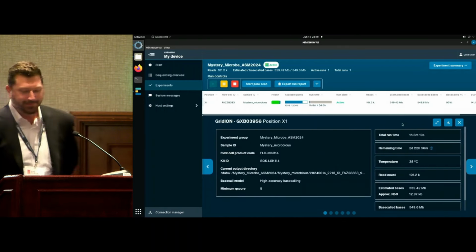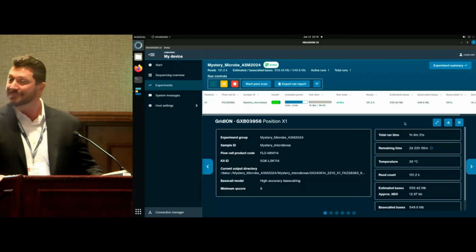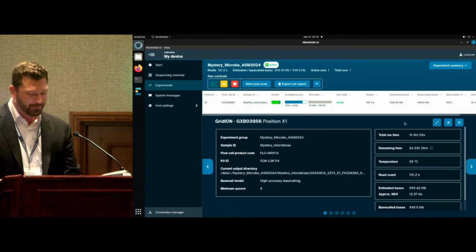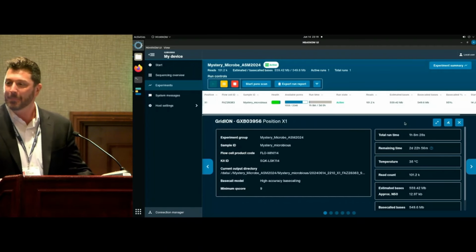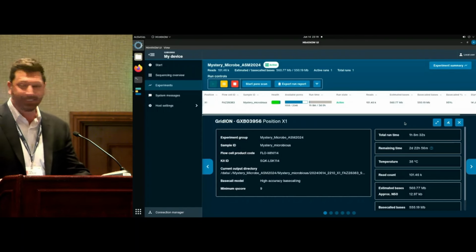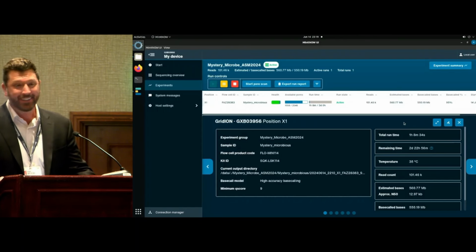So now you can actively start guessing. Hint 1 for this is that it is a gram-negative bacteria. Hint 2 is that the genome size is approximately 2.5 megabases. Broad hints. And back to you, Aaron.